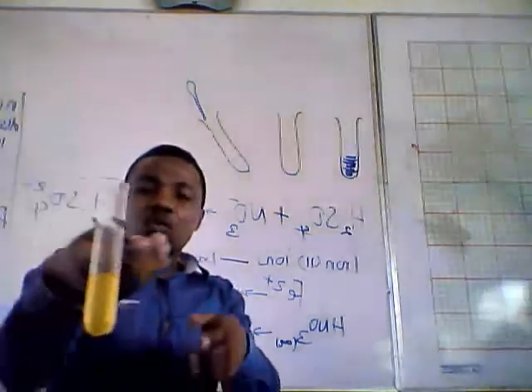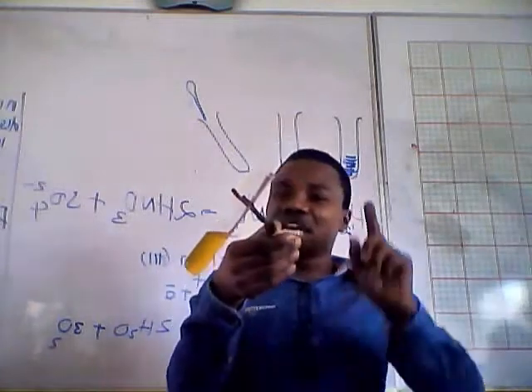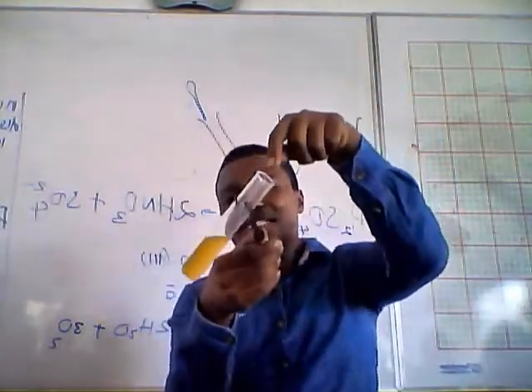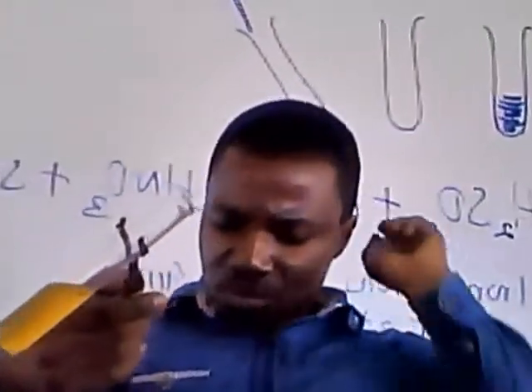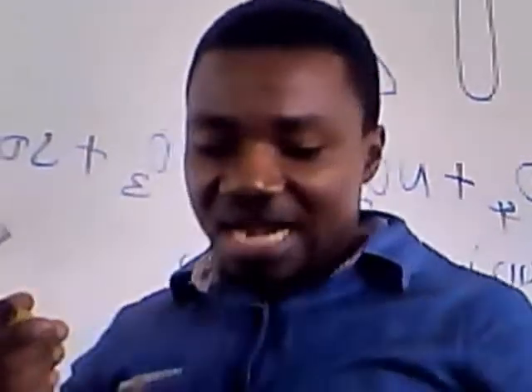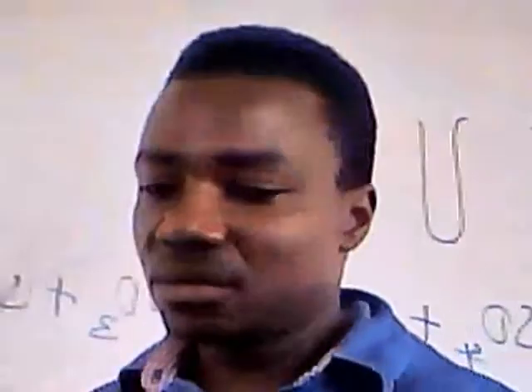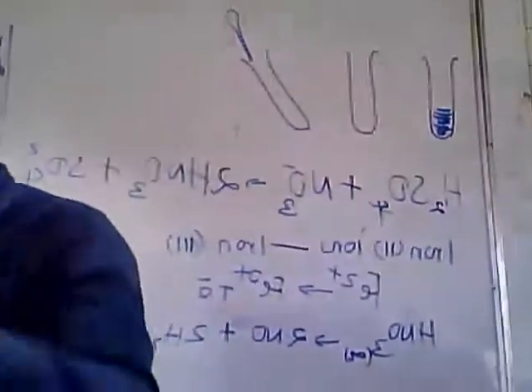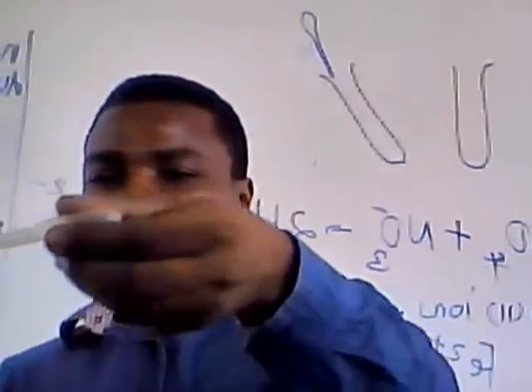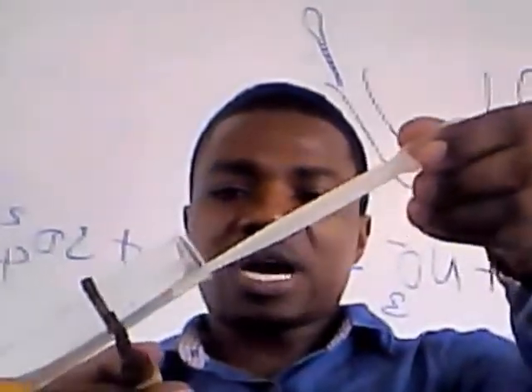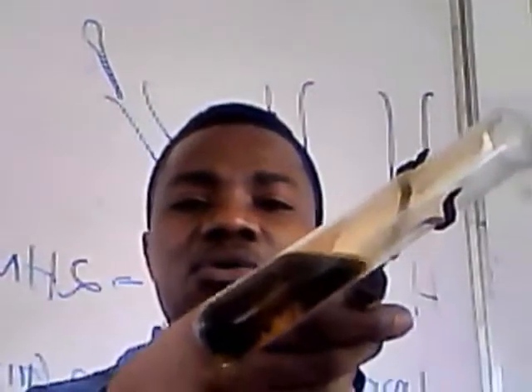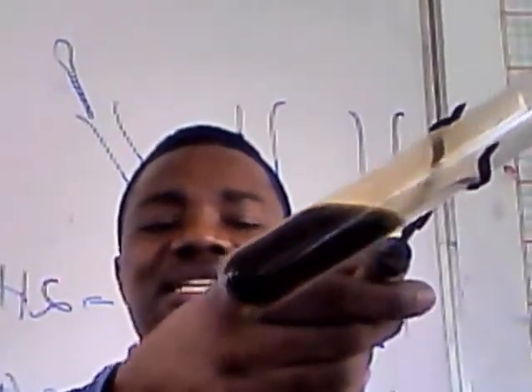Now, while it is slanting, you add sulfuric acid — not directly, but through the side. In a slanting position, carefully add concentrated sulfuric acid down the side. So I add the sulfuric acid down the side.